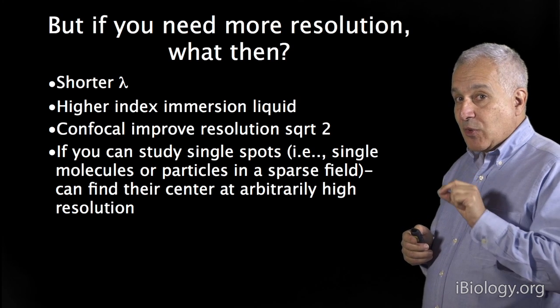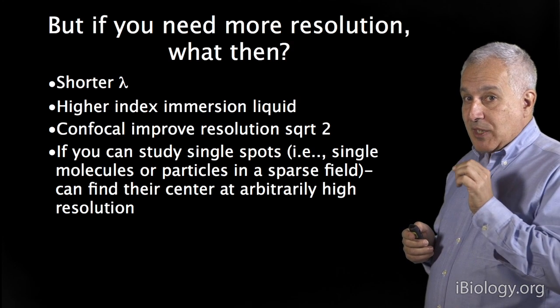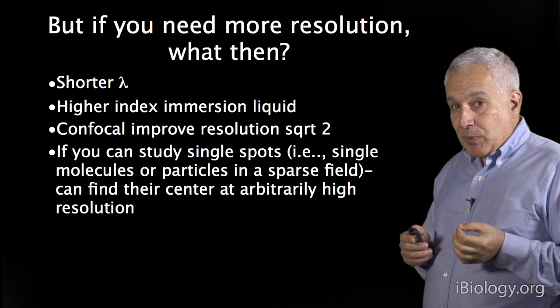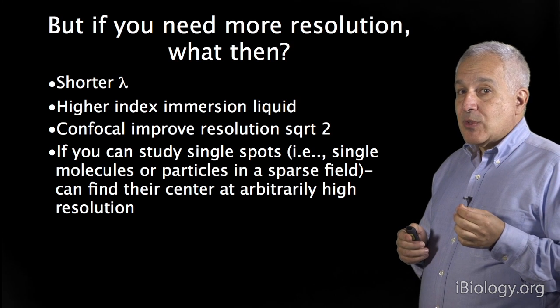So people who track the movement of objects can go well beyond the diffraction limit, because the movement of the object from one place to another can be tracked by looking at the center of that spot. Indeed, some of the super resolution techniques take advantage of just that property.